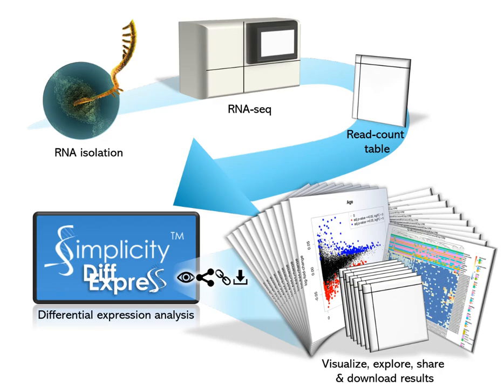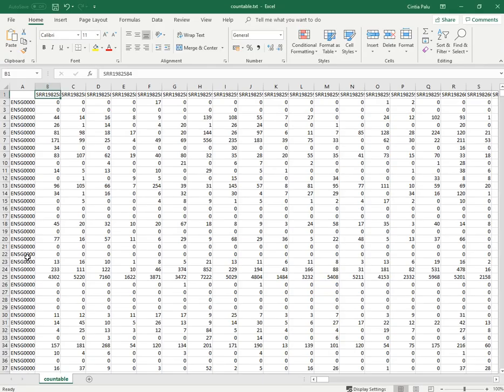So what we'll need is a count table like this one here, where each row has the count of a specific gene or transcript, and each column has a sample, and both the sample names and the transcript identifiers must be unique, but no specific pattern is required.